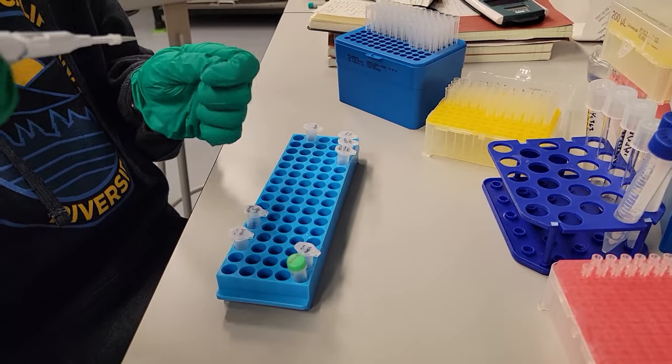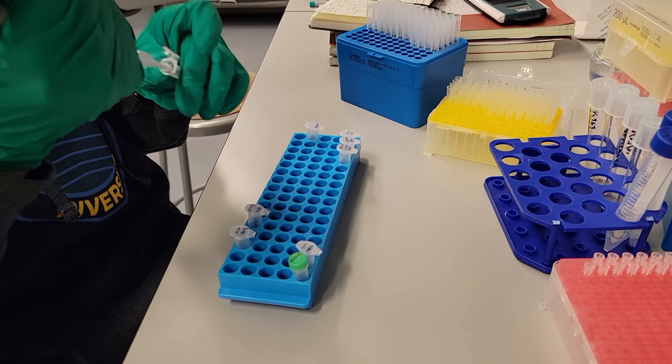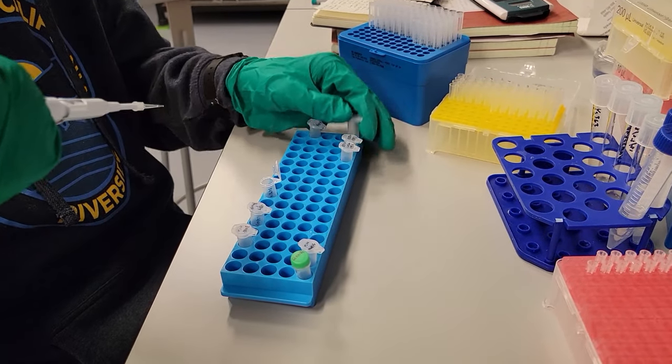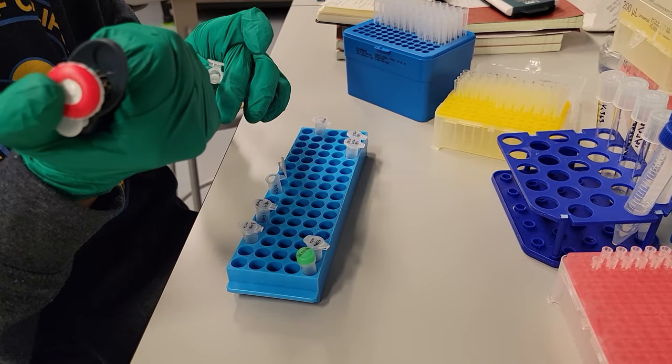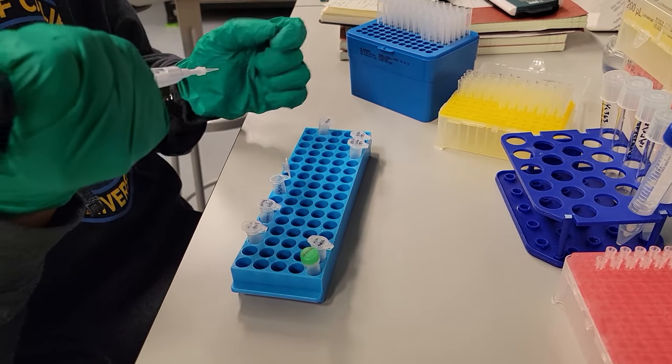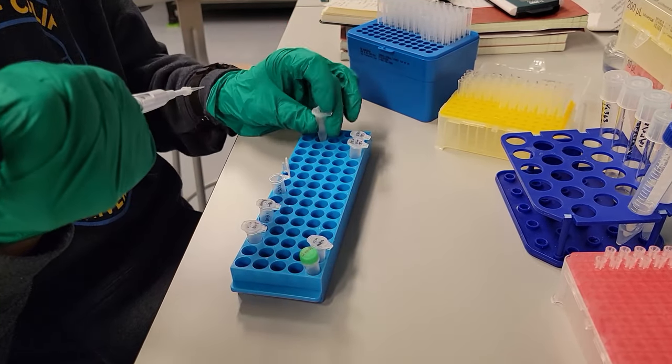We'll design a chemical extraction method to get these compounds out of the yeast, then use a very common method called high-pressure liquid chromatography, or HPLC, to precisely separate and identify these compounds. This project will touch on fields like synthetic biology, analytical chemistry, and bioinformatics. My intention is not necessarily to teach you every detail of the process, but more to show you what this field is all about.